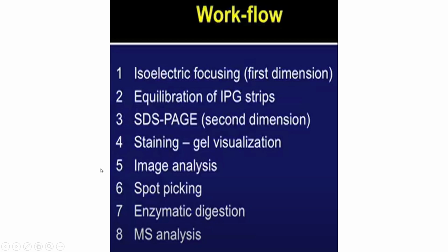So there are two analyses. You can initially do image analysis to understand which proteins are getting upregulated and which are getting downregulated. Basically you will have a diseased one and a control patient, and you try to find the difference between them. Then mass spec will allow you to have much more accurate results than image analysis. So if you want to do further analysis, mass spec is one of the best techniques to study proteomics.